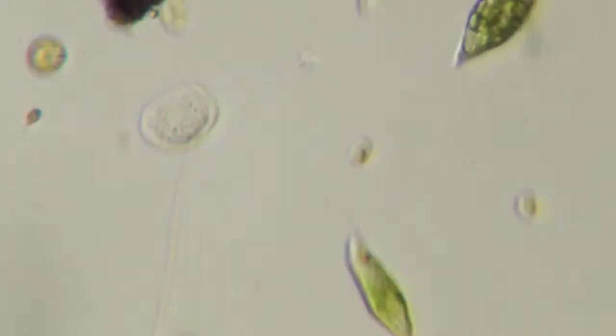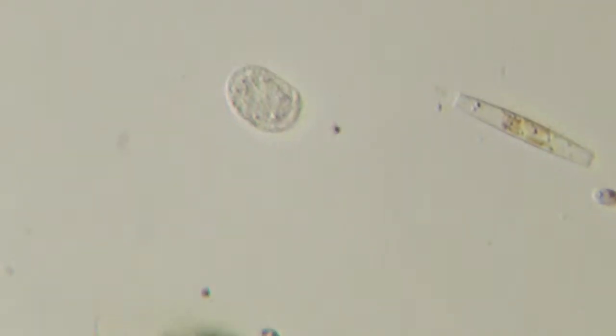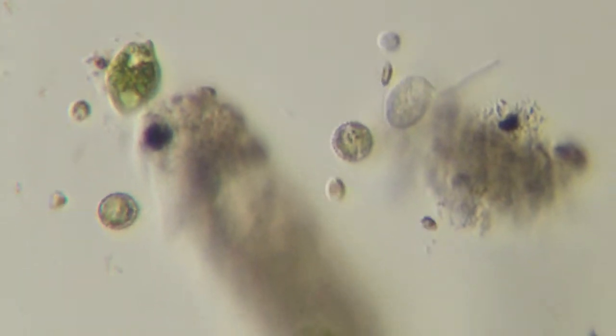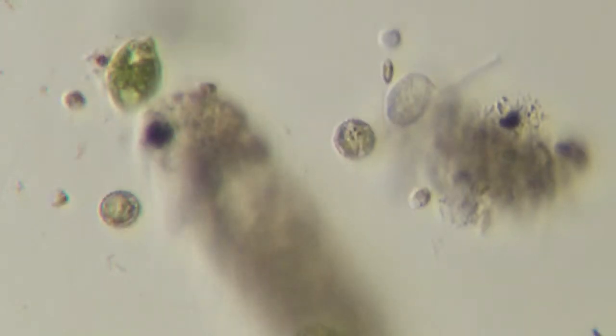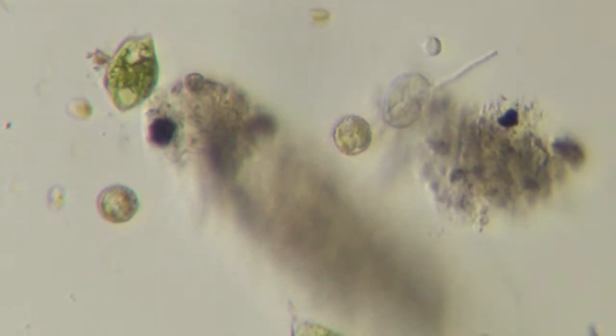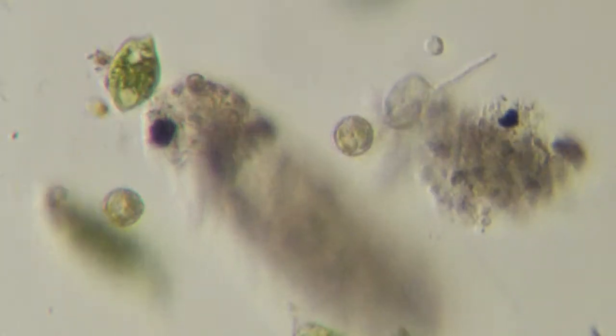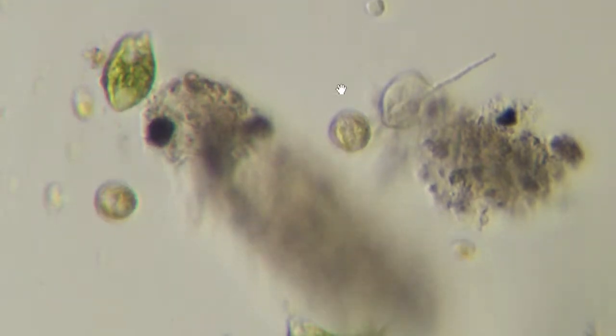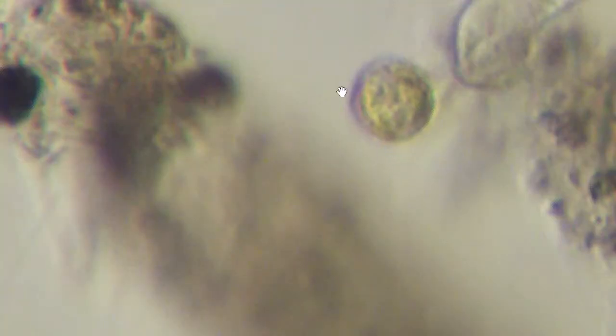Very cool. I have at least one or two videos of these guys expiring and exploding. Their contractile vacuoles stop working and they pop. Oh, look at that little guy. I haven't seen one of those before. That little sphere with the dots on the outside. Whoa, there goes a nematode. Just destroyed the whole scene. Like I said, very busy slide. Look at that little dude there. I have no idea what that is.